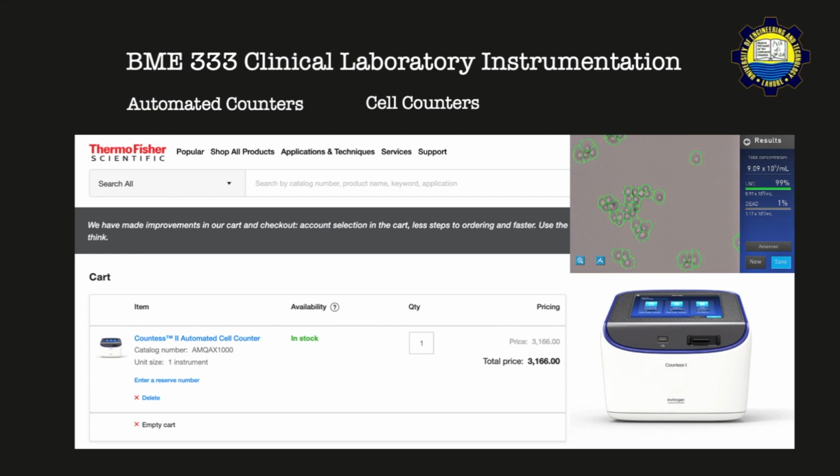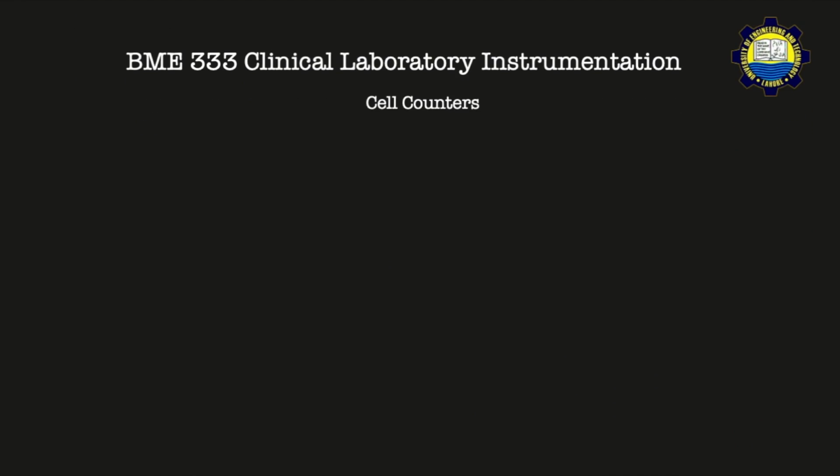Also, look at the price tag for these automated cell counters and compare that with the hemocytometer that we had, which came in fairly cheap as compared to this price tag. So that is it for this discussion today. We're now going to follow up with our question and answer session, and we're going to go over the two problems that we have put up in this module, one of which was the cell counting and the other was trying to find what the implementation for this automated cell counter was.